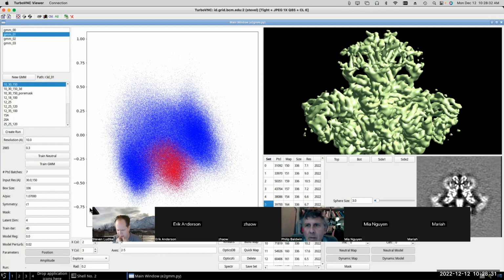Well, if you want to look at, for example, the other example I often use is the in situ nuclear pore complex, where there's a lot of variations in the membrane thickness as it approaches the NPC. That sort of thing looks fine, but you have to have some sort of a fixed geometry, right? So when you put the particles into this, the orientations already have to be determined in some self-consistent way. They don't have to be perfect. They just have to be self-consistent.